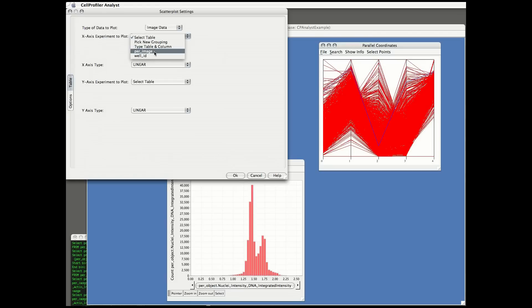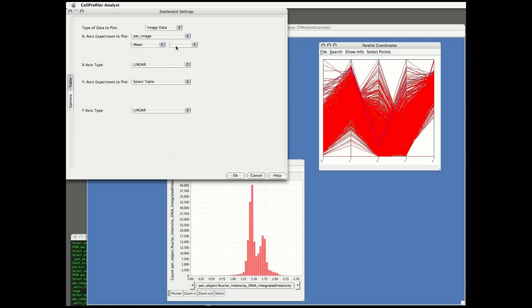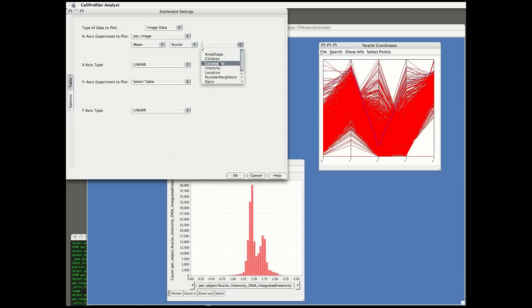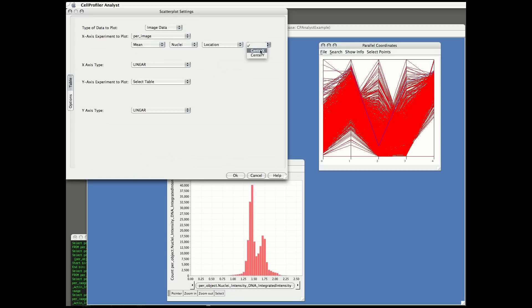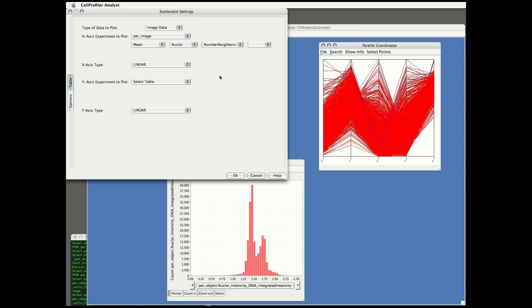I'm going to make one more scatter plot to show you how brushing in CellProfiler Analyst works. This scatter plot will again have two features plotted for image data, just like the first plot we made. We can explore relationships between features using this brushing capability.